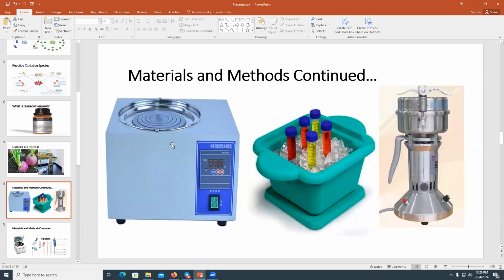Then we're gonna boil it. After we boil it, we're gonna add it to cold ice, and that is known as blanching to stabilize. Just after we heated it up, we add ice. And then after we add ice, it's very important that we go to the next step.